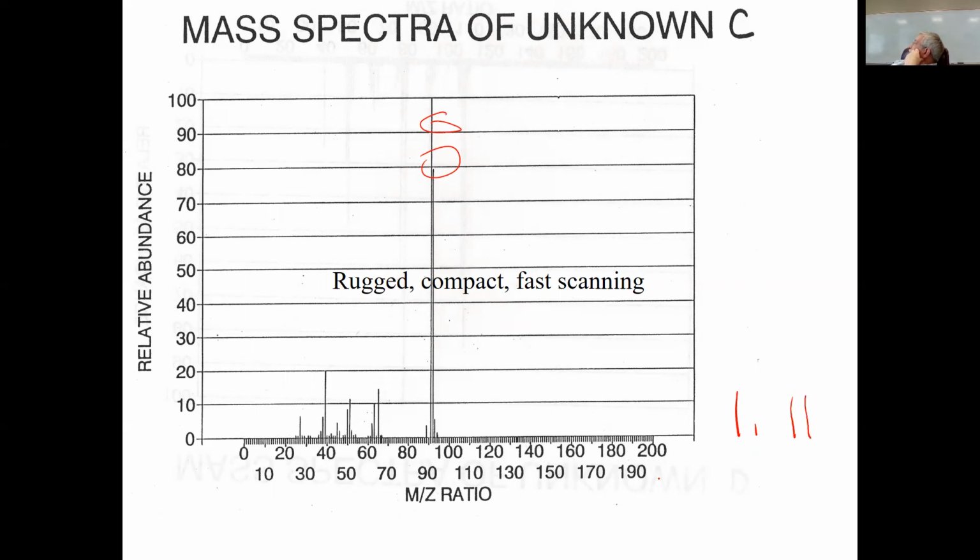But remember, if this is chlorine or bromine, then this would be a difference of 2. And these two peaks right here are just 1 apart. Some sort of isotope. Well, could be just the loss of a hydrogen, couldn't it? If you have an aldehyde or sometimes an alcohol, sometimes you can lose just the one hydrogen. But there's other places this could happen.